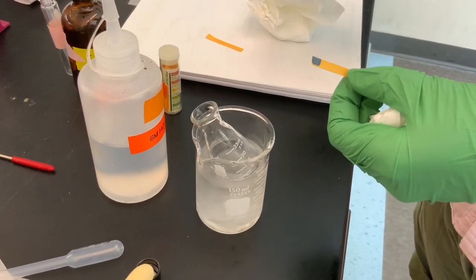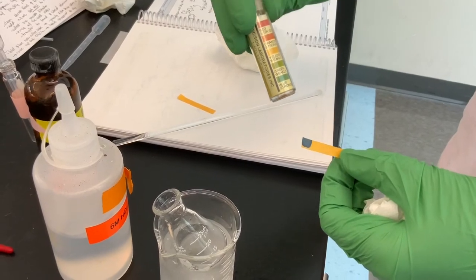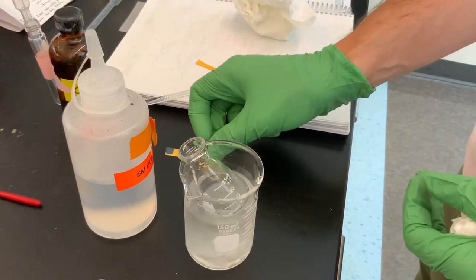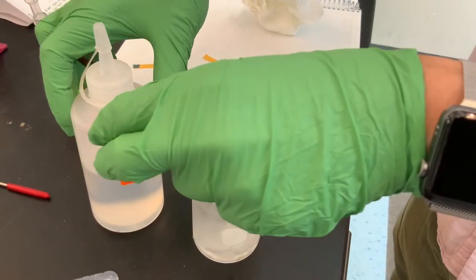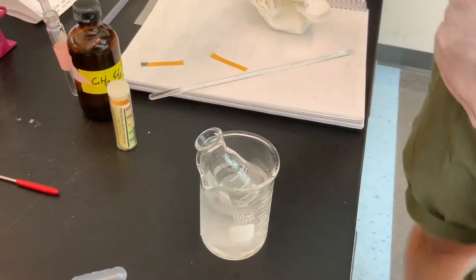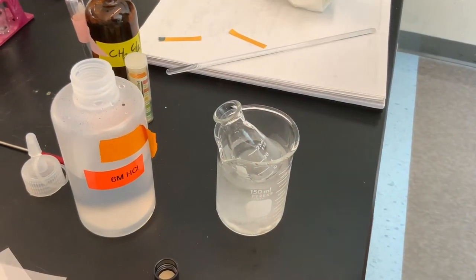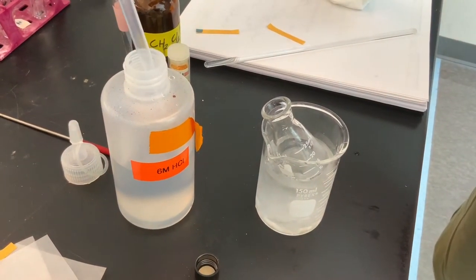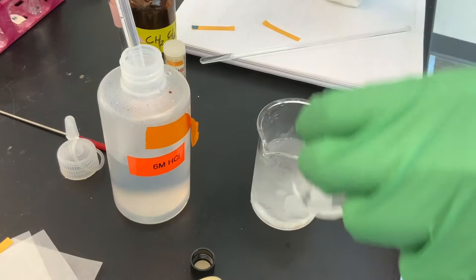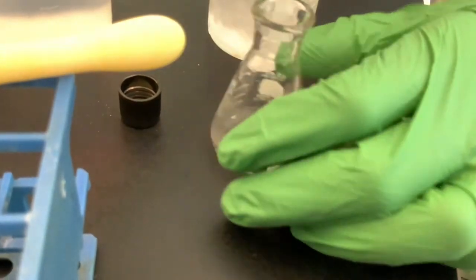We've got blue. Of course, we expect that because we used sodium hydroxide. So this is a pH around 10 to 12. So very basic. And so now we're gonna add 6 molar hydrochloric acid. And this 6 molar hydrochloric acid, we're gonna start with around 2 milliliters. And we don't really need to chill it because we're not afraid of hydrolysis or anything. We're going to chill it for a little bit to decrease the solubility of benzoic acid.